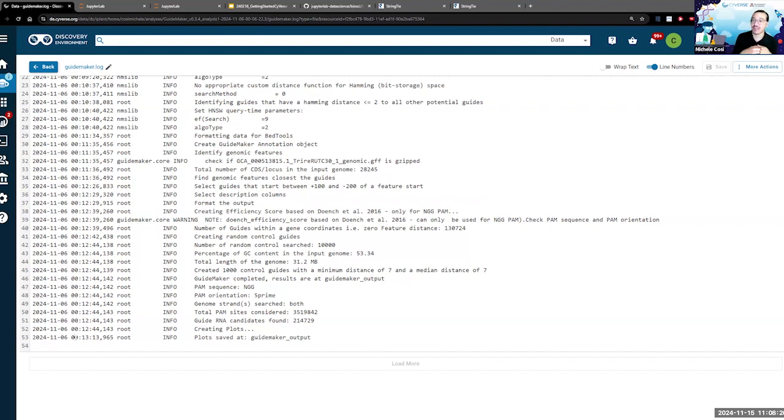So for the first example that I've given, maybe you need to give more RAM to your application run. Or for the second example regarding the input file, maybe your GFF file is wrong and you need to re-download it, or maybe modify it such that the headers are correct.